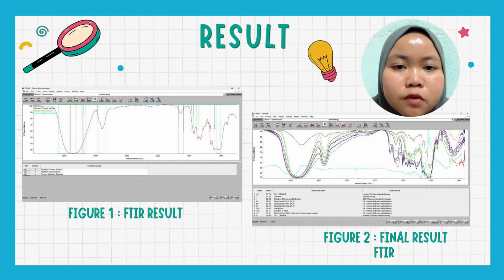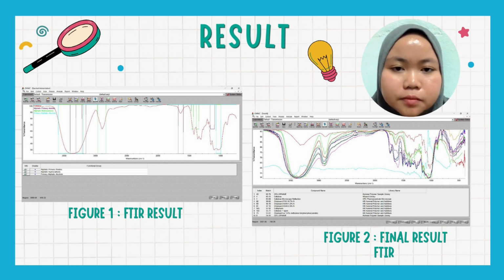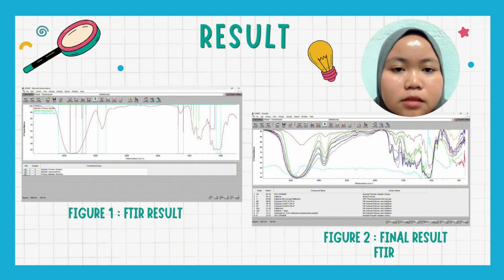Peaks for OH stretching at 3200 to 3550 cm-1, CH stretching at 2800 to 3000 cm-1, and CO stretching around 1004 cm-1 match a cellulose structure, while the match with chipboard suggests a lignin or phenolic resin component. This is supported by peaks in the fingerprint region, 1500 to 400 cm-1.